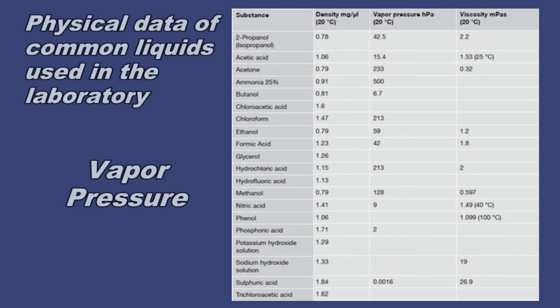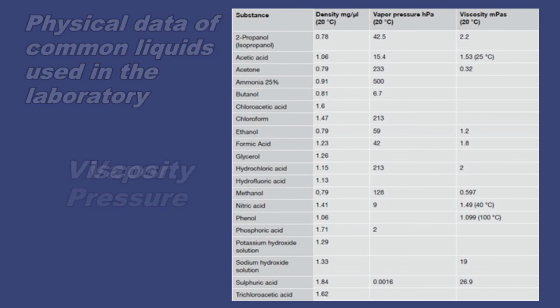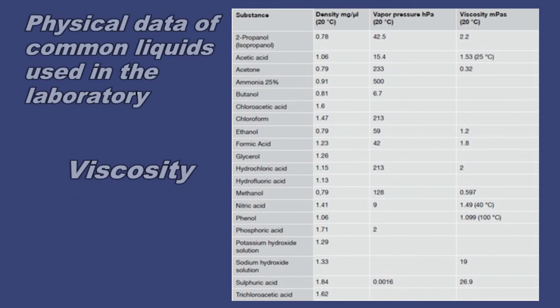Volatile liquids such as solvents cannot be dispensed with the accuracy and precision specified for distilled water. Use reverse pipetting and pre-wet the tip for at least 1 minute. However, the pipetted volume will always be lower than the nominal volume.